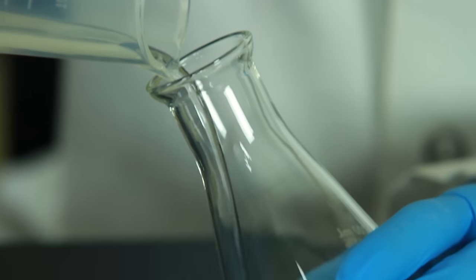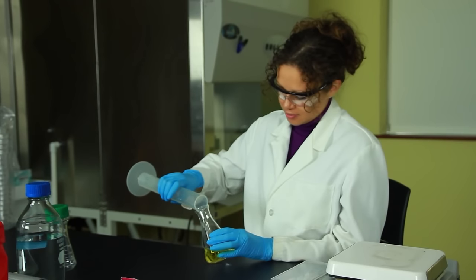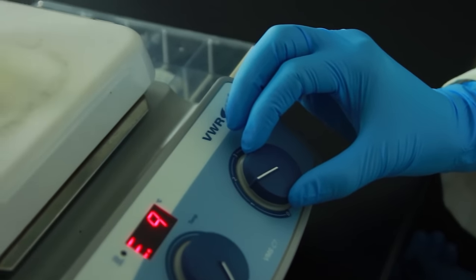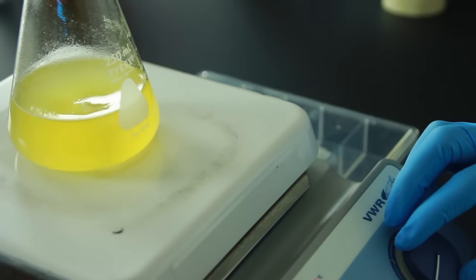After about 2 minutes, add the remaining 25 milliliters of water from the graduated cylinder. Stir the solution until all of the visible clumps have been broken down.